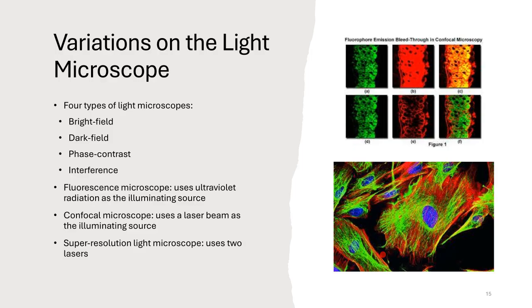This is an example of fluorescence microscopy where we've used a GFP dye that is attracted to one kind of tissue type, and an RFP, a red dye, that's attracted to another tissue type. Usually this blue one is called DAPI stain, and it's attracted to DNA in nuclei.